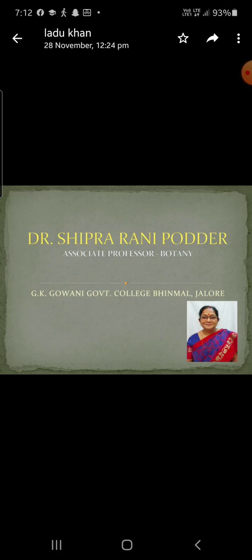The outermost layer forms a one cell thick epidermis which is covered by a thick layer of cuticle. The upper epidermis is continuous whereas the lower epidermis is interrupted by sunken haplocheilic stomata which are confined to the wing. The epidermis is followed by a layer of sclerenchymatous hypodermis.